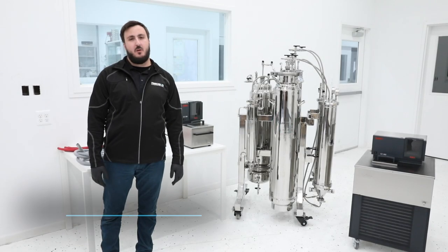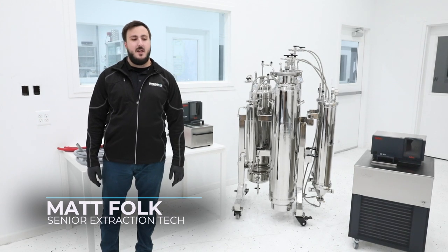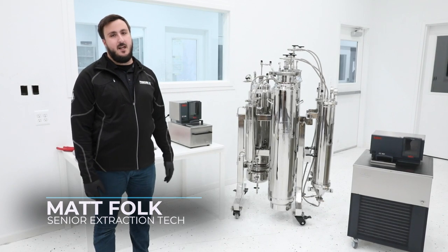Hey, what's up guys, this is Matt Folk with Precision Extraction Solutions. I'm one of the senior level technicians here. Today we're going to be talking about connecting TCUs to your X10 MSC.